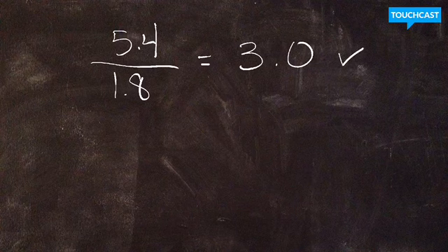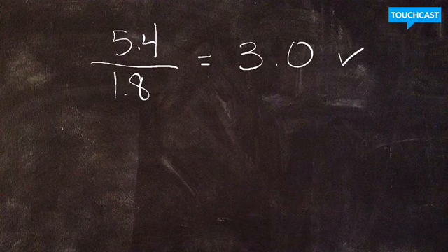In part E, they want you to calculate something called the resolution. This is a measure of how well the two dyes are separated by the column. You know, how effective was the column at separating out the dyes. And they give you a pretty groovy little formula. Don't worry too much about it. Let's check it out, okay?